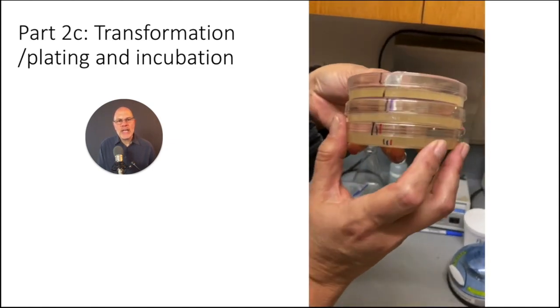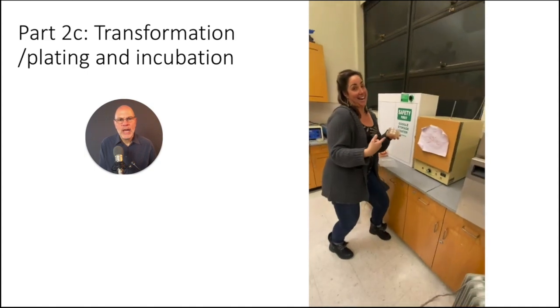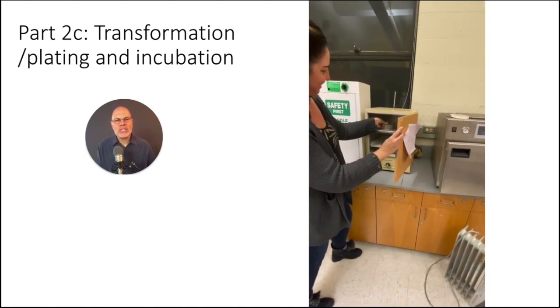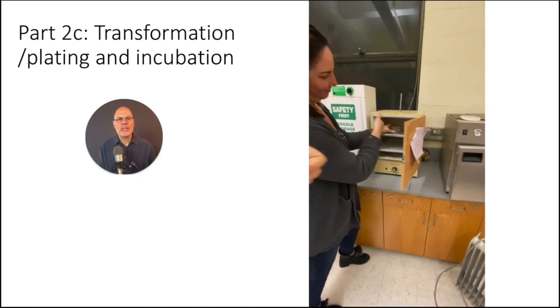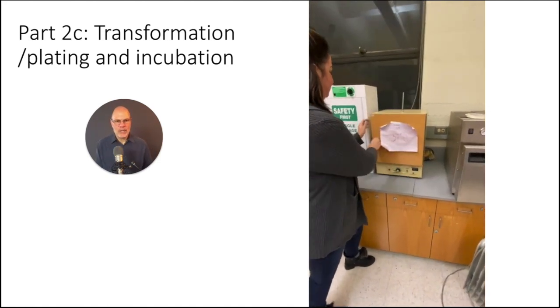Now she's taking these plates where she has the bacteria, and she's going to put them in the incubator, and she is remembering that you've got to put them in upside down, otherwise they'll be super messy. Getting a big thumbs up. Way to go, Johanna. We've now incubated our bacteria. We let them grow for about 24 hours. Let's see what happens next.